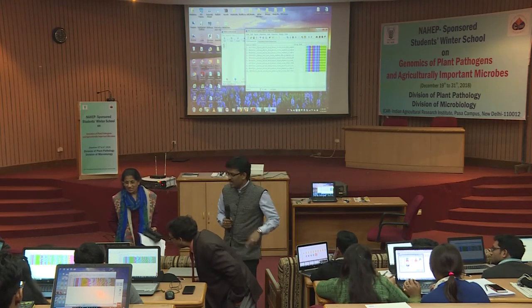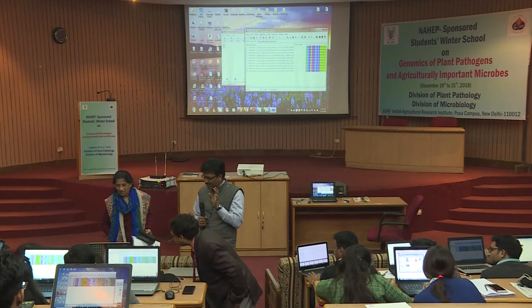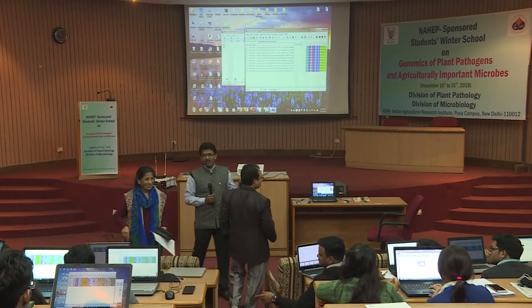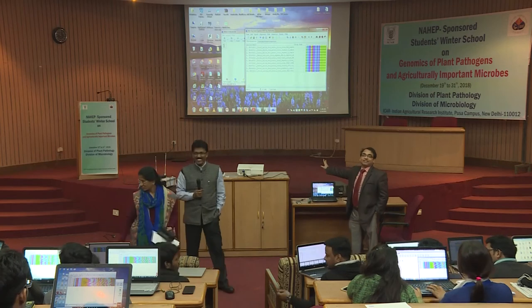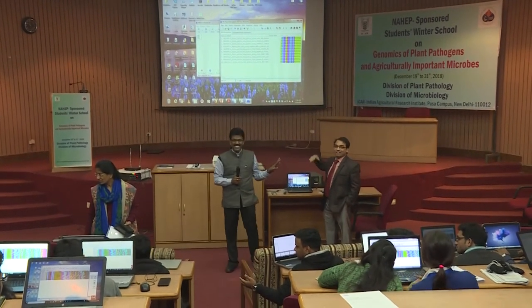Did you save it in .fas format? Control A, save as, give file name .fas. It has opened. Okay, I think except one person, every one of you could open it in Mega. Is everyone's computer showing these two windows or not? Because if we go ahead, we cannot come back again.